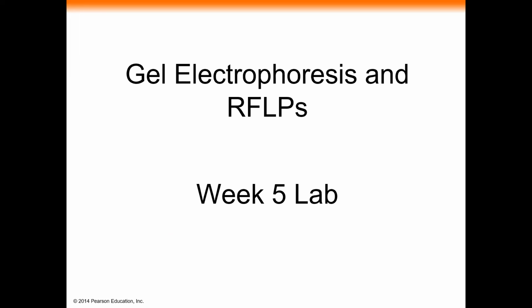So gel electrophoresis, it's been around for quite a long time. It's been used since roughly the 1960s. I know gel electrophoresis has been used in protein isolation since the 1970s. It's a different type of gel electrophoresis called sodium dodecyl sulfate polyacrylamide gel electrophoresis, or SDS-PAGE. And the only reason I know that that's been in use since the 1970s is I used to work in the lab of the guy who invented it, and he did it in 1974.